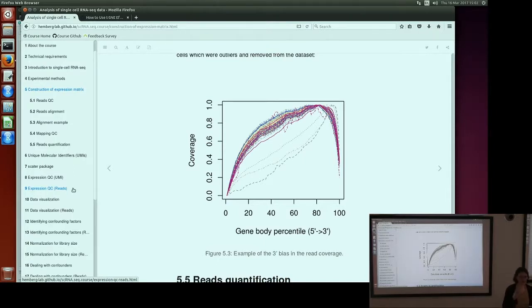It's mostly if you're looking for marker genes, if you're looking for which genes are most highly expressed in your cells, then it will matter. Or potentially gene-gene correlations might be affected. But if you're just looking at differential expression of a gene in different conditions, it doesn't matter.